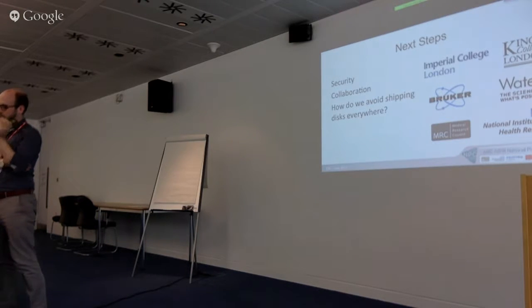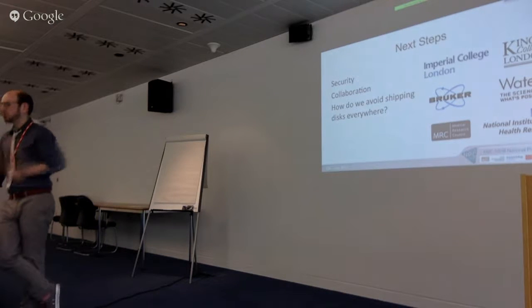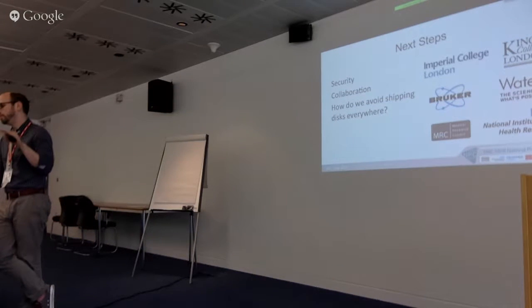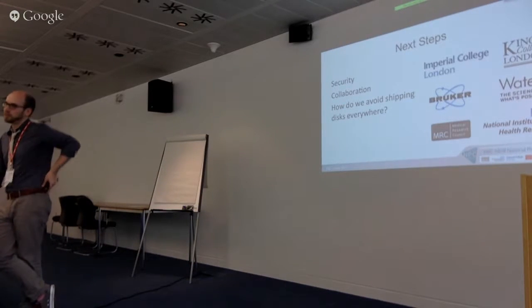I think it's much better to work at a high level, cut out all the very lowest things and say, we're confident that these are all well above our limits of detection. We would be able to identify them should they become significant. No, I agree with that point of view.